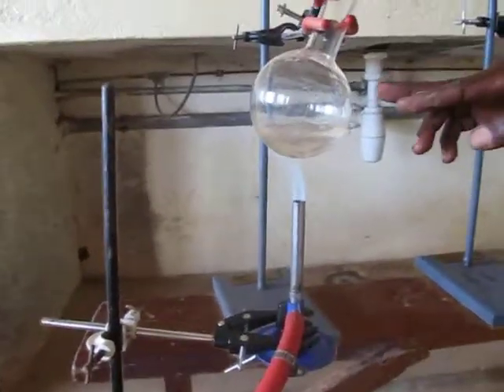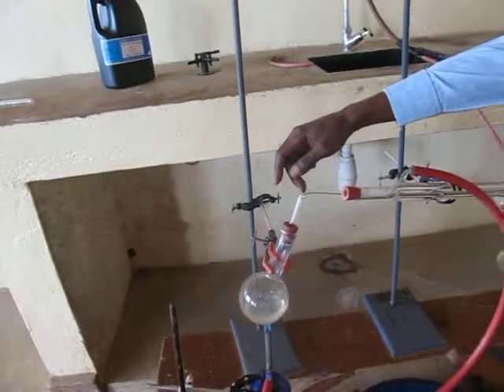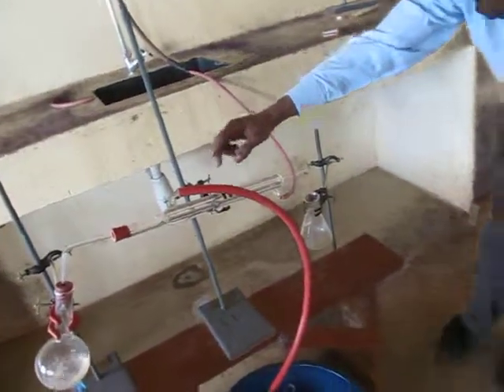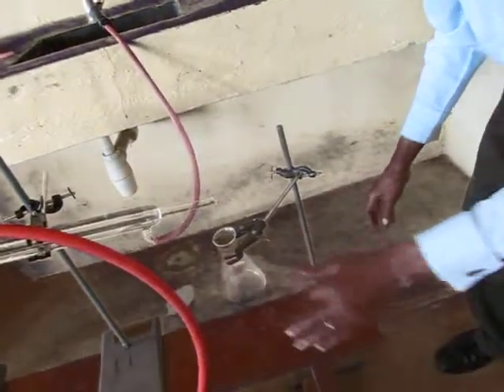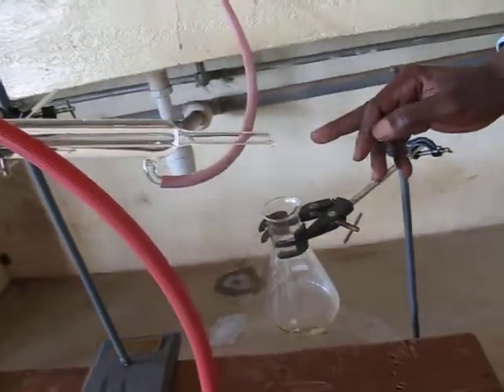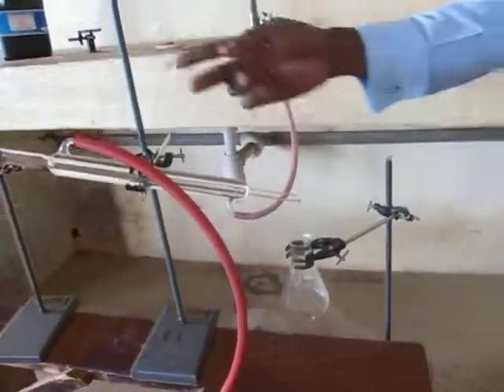When the fraction boils, the vapor comes up through the delivery tube, comes to the condenser, the Liebig condenser. It will be condensed, and on this other end now you can see our first distillate coming out. Our first distillate is now coming out. This is the distillate of the fraction whose boiling point is lower, and in this case it is ethanol.